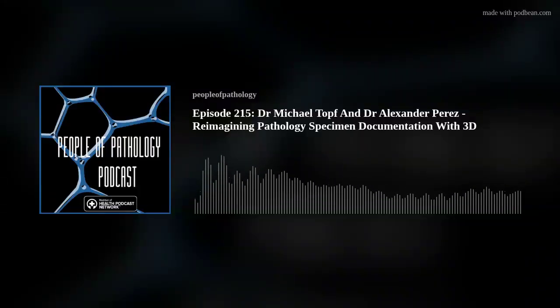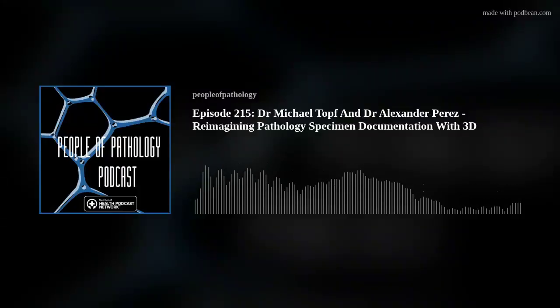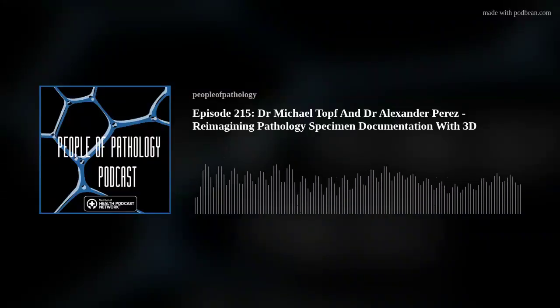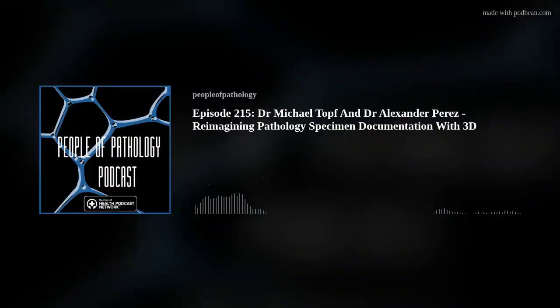And I'll just emphasize one more time that, to my knowledge, there are no FDA approved 3D scanners of surgical specimens. I would love for one of the hardware companies to take that on. There are intraoral scanners that are approved for dental use, which you may see at your dentist, but for surgical specimens there's no FDA approval, and therefore we do everything under an IRB.